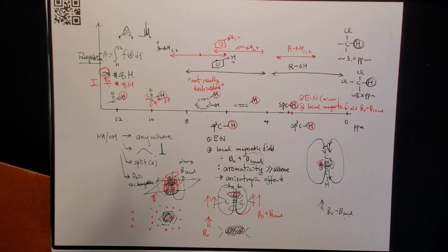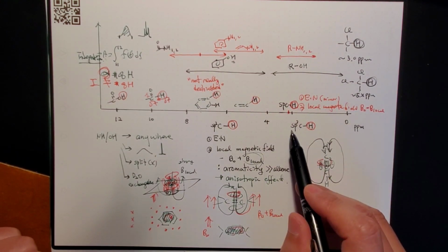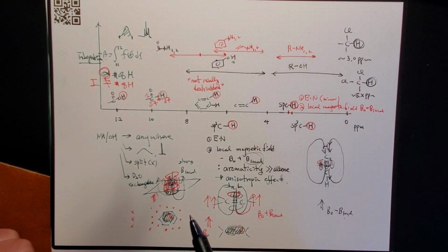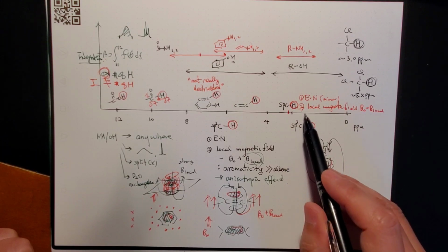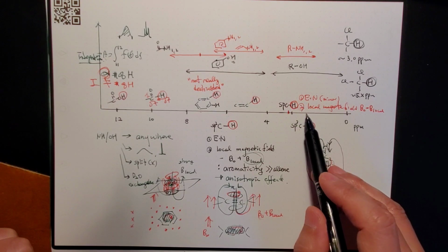Hydrogen NMR spectrum. Let's briefly go over the spectrum again. The typical values first, then some of the variations. First, 0 to 4, you get the sp3 CH. Those hydrogens, with all carbon attached to the carbon bearing the hydrogen, normally give a number around 1 ppm.